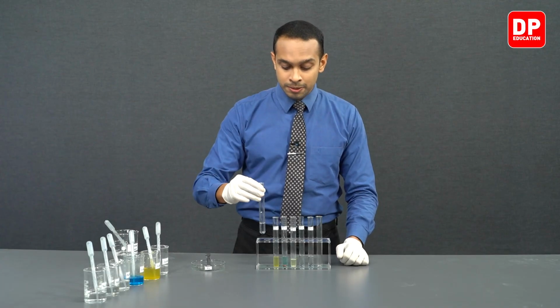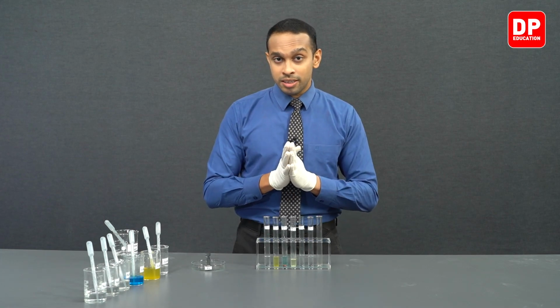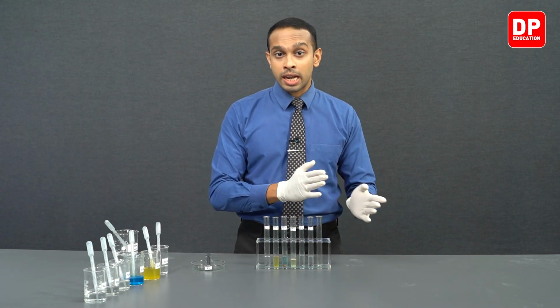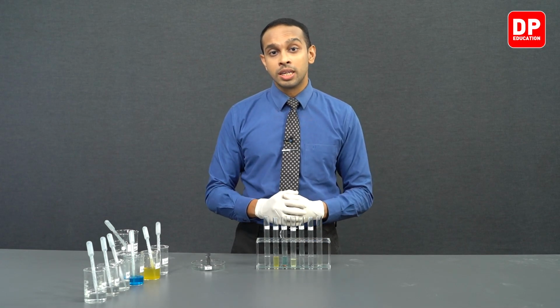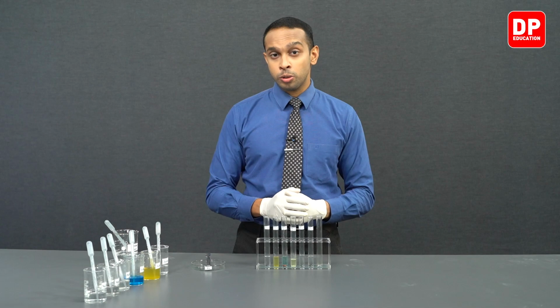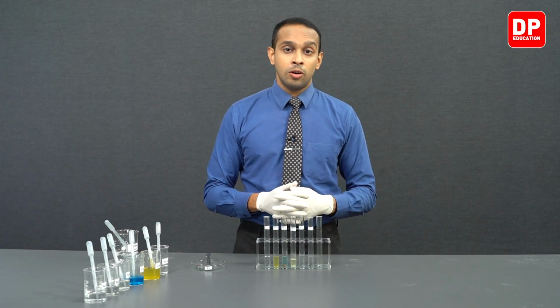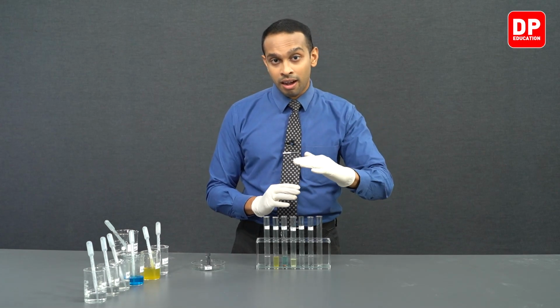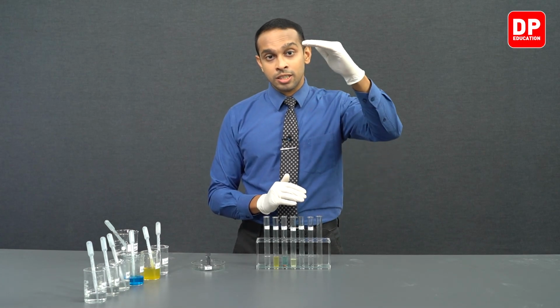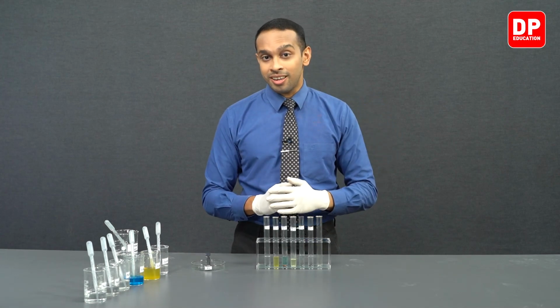What does this indicate? This indicates that iron is not more reactive than zinc, or in other words, zinc is more reactive than iron. So in the reactivity series or activity series of metals, zinc ranks higher than iron. Zinc is found in a higher position than iron.